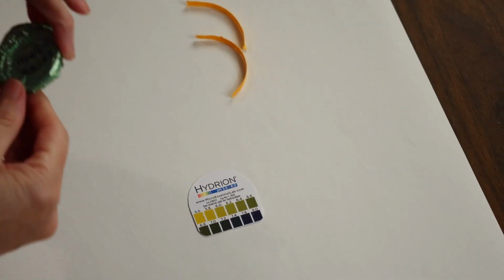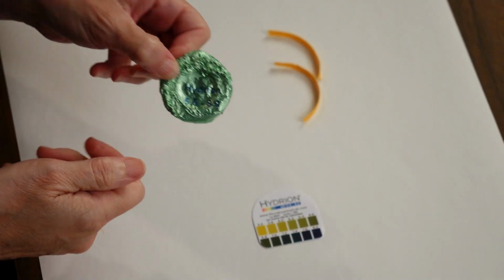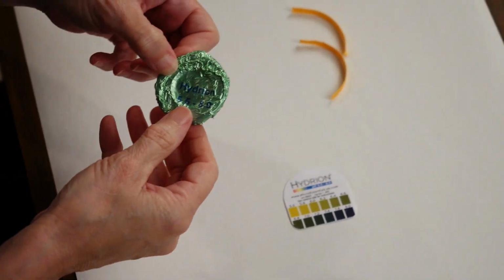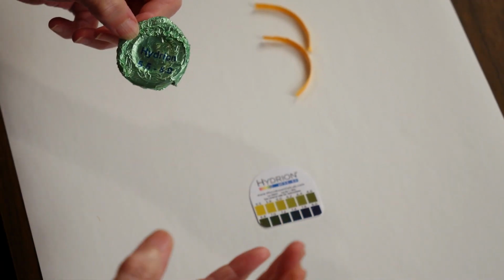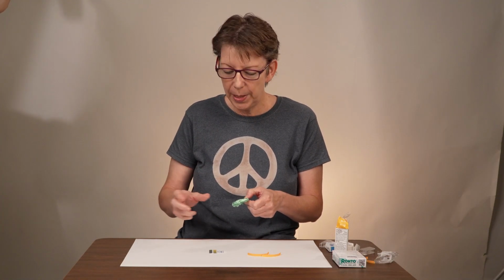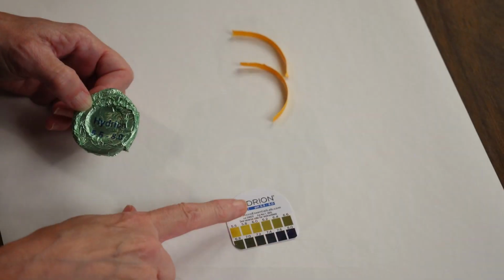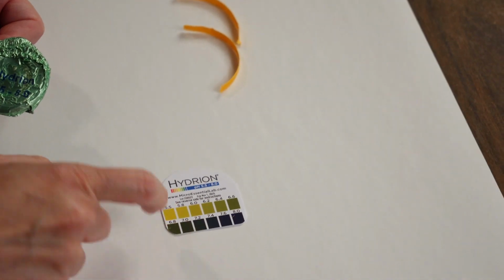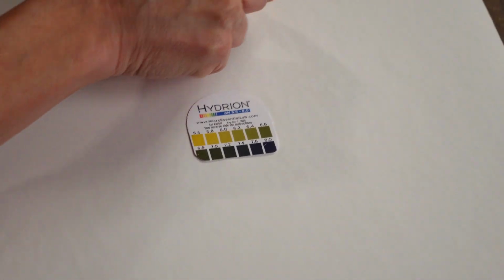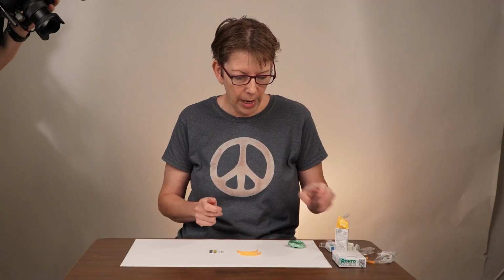What we have here is a roll of pH paper. And this is the exact same pH paper that I use in the office when I need to test a patient who may have gotten something in their eye like dish detergent or vinegar or, God forbid, drain cleaner, to tell me how out of whack the pH of the front surface of their eye is. And this is the little card inside the box of pH paper that's going to tell me what the reading is. Here's a couple strips of pH paper, which I tore off just now. It doesn't like to be exposed to air.